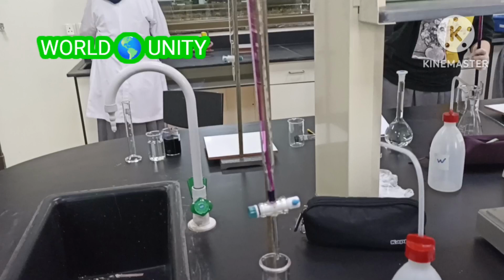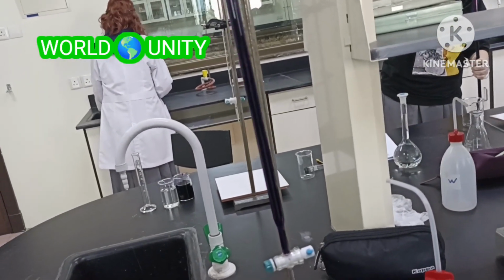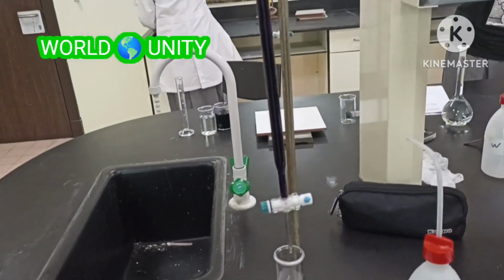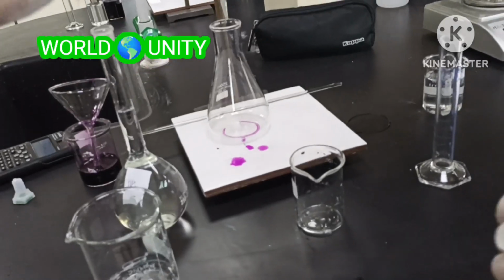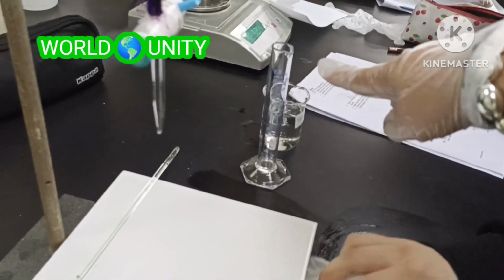You hold the funnel up a little bit. Keep it up, yes, that's good. Until 50. Oh, that is such a pretty color. Until 50. Yes. Do you think it's enough? Okay, we need to wipe. And then next. Did you use this before? No? Okay.